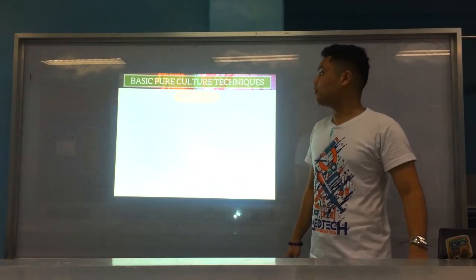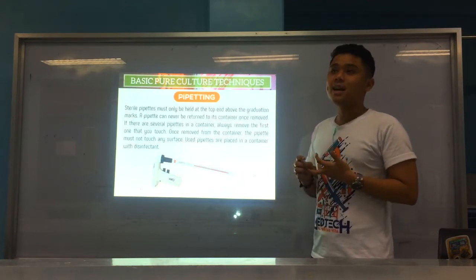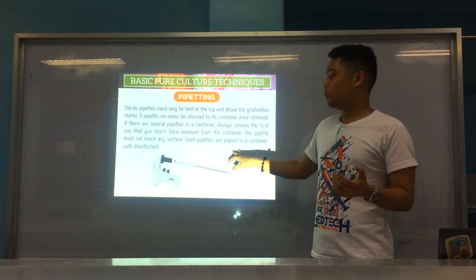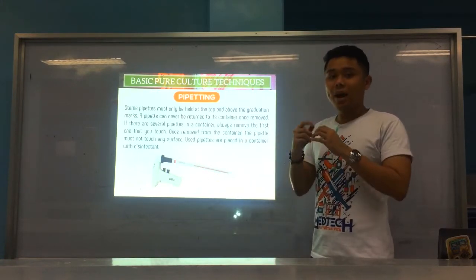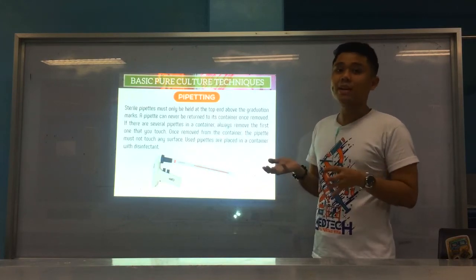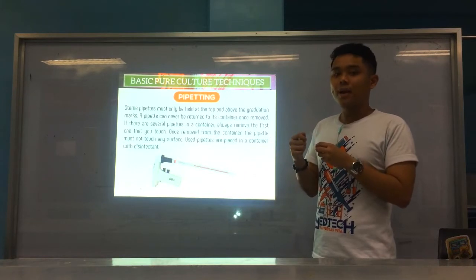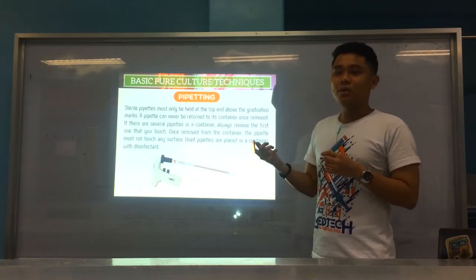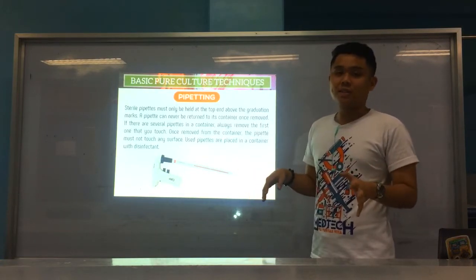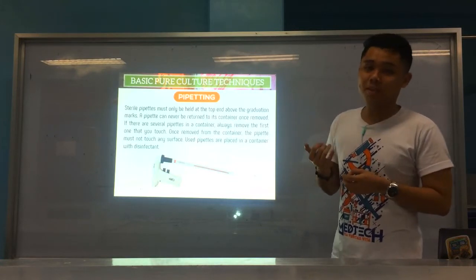Now next, when we come to pipetting, we always use a sterile pipette. In our culture activities where a pipette is needed, we use the serological pipette, and it is wrapped in paper. If it is wrapped in paper, meaning it has been autoclaved. So you just peel the paper open once you use it. And once it is opened, it should not touch any other surfaces aside from the culture media where the inoculum will be dispensed.